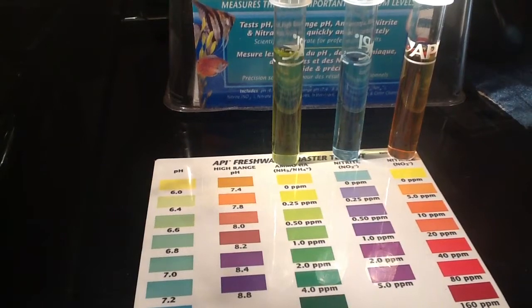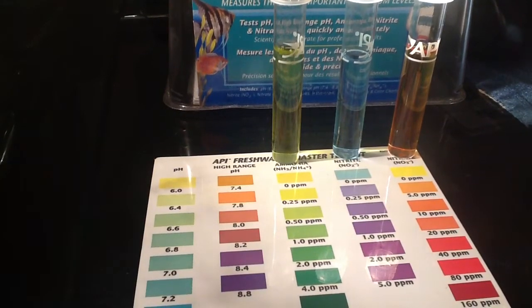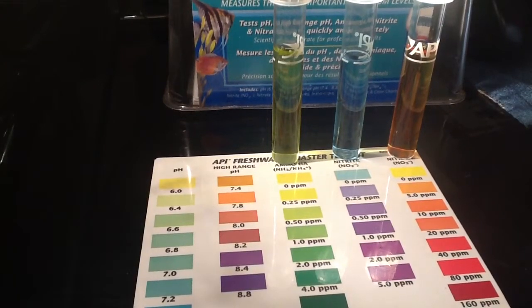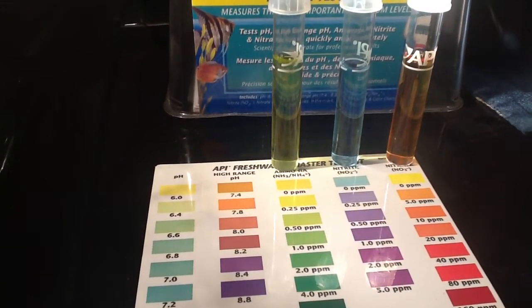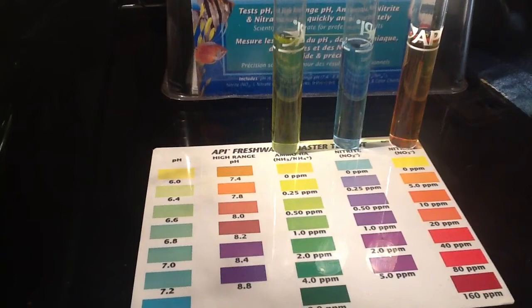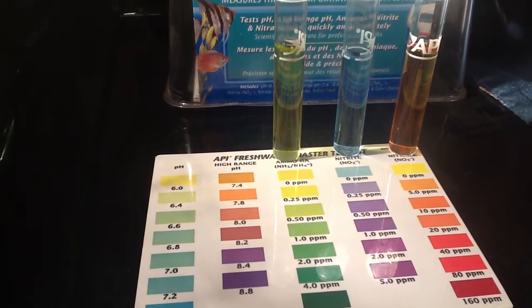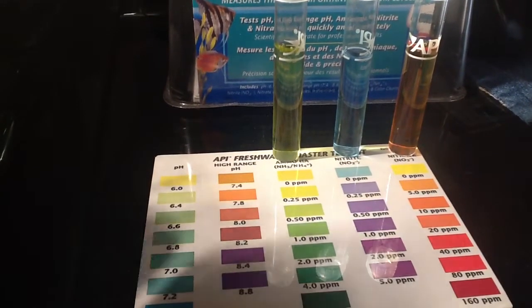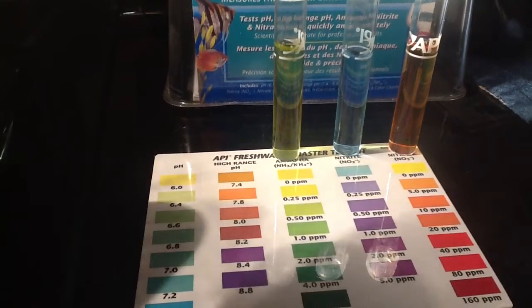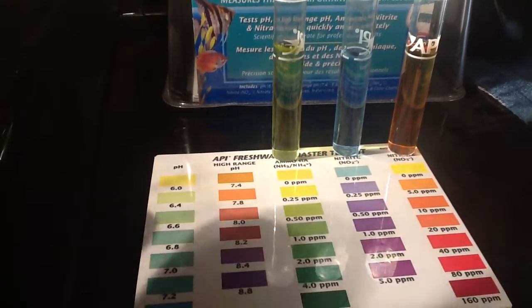What I'm going to do is go through my results. I'm not going to show you my pH readings - that's a reading I'm happy with, it's stable. I-class stability is more important than what a lot of other fish keepers say for discus. I personally believe that to be crap.